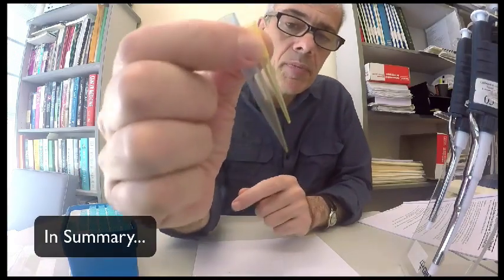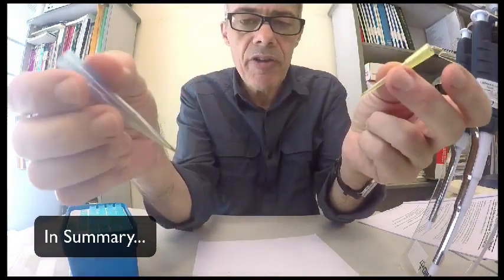Be sure to use the correct tip for the pipette. There are various size tips. I've shown you two here. The blue one is for the P1000. The yellow one is for the P200.